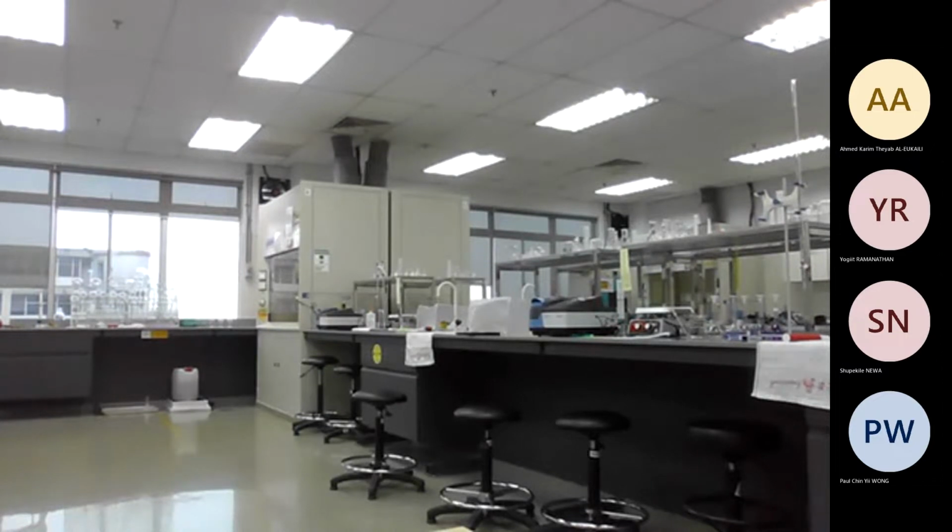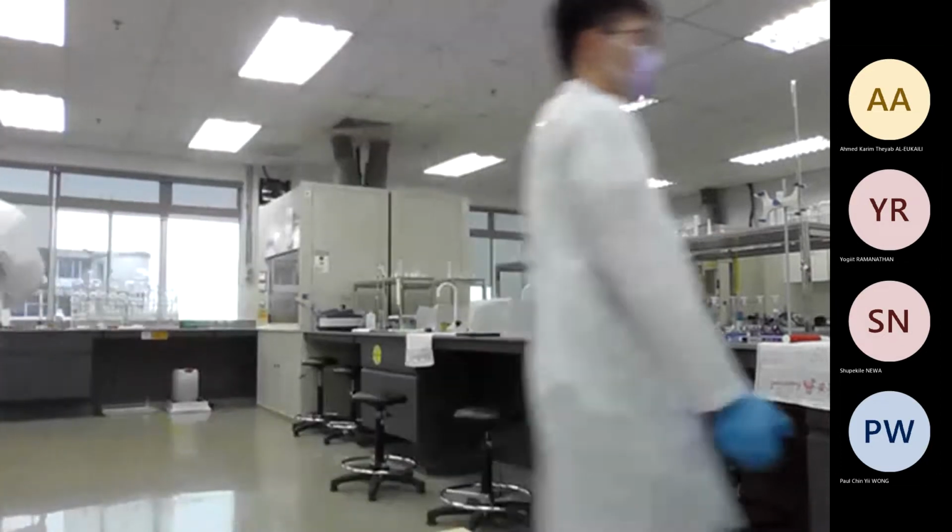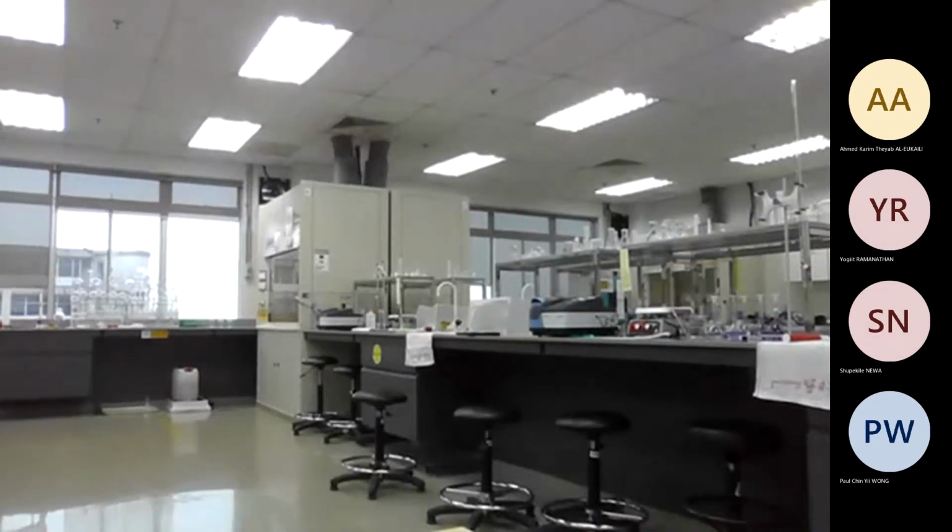like it more. I mean, now it's a bit less. Just now was a bit. No, you prepare it, so it was not exactly, I mean, accurate volume. So you have to make it again.